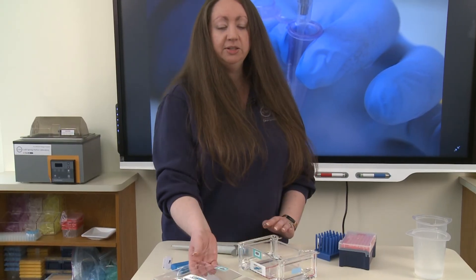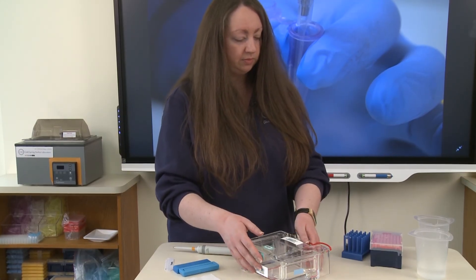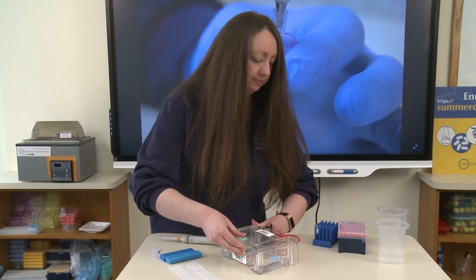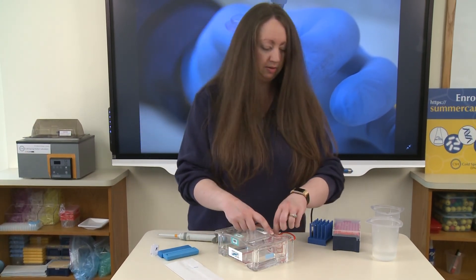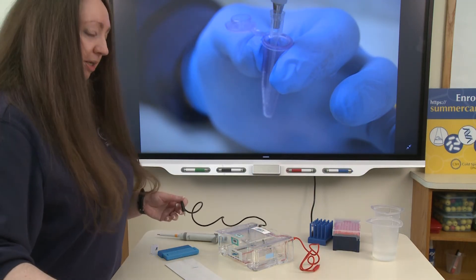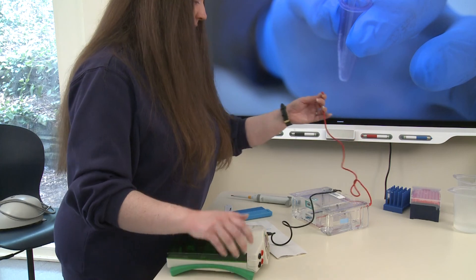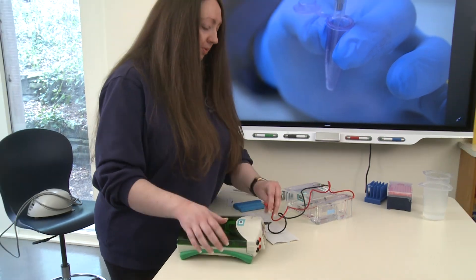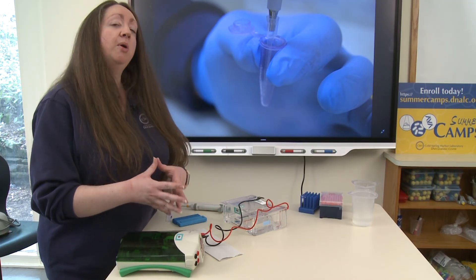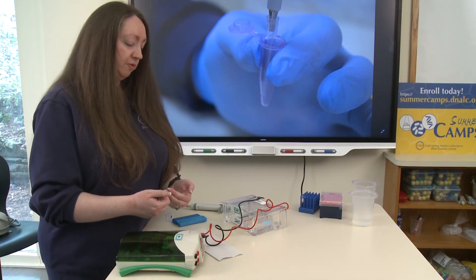The last thing we need to do is place the lid on our gel chamber. Make sure that it is on tight, and you're going to plug your cords into the power supply — again, black with black, red with red. You want to make sure you keep the positive and negative charges consistent so that we can accurately mobilize the DNA through the gel. As mentioned in other videos, smaller fragments of DNA will migrate faster and will move further through the agarose gel, while larger fragments will remain behind.